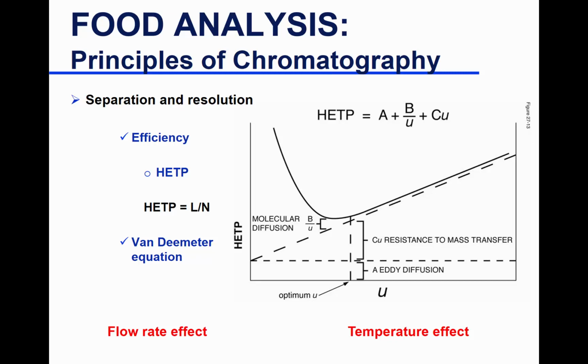Then you're losing efficiency. Here you have a really sharp peak because it's not diffusing within the column, but here you have this really broad, bad peak. Okay? So the shorter, the better. Bigger, not good. So when we know this, then we look at the relationship of different factors that impact the height equivalent of a theoretical plate.